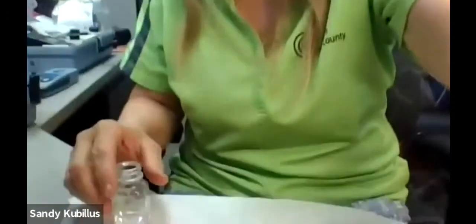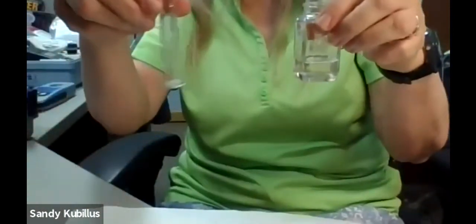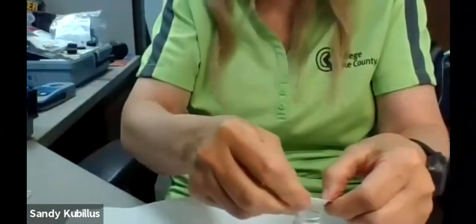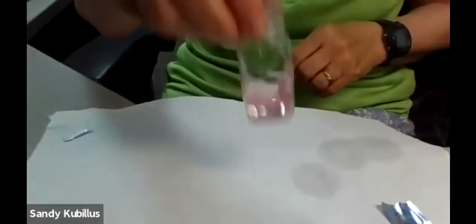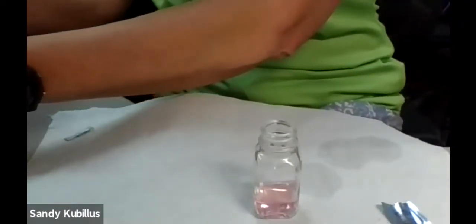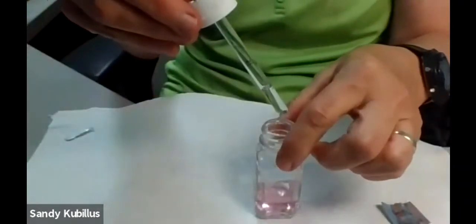Okay, so this is for hardness, and we have our sample, which we collected using this 5 ml tube, and then we'll add this chemical to it, and you can see it changes it to a pink color. Then we're going to add this EDTA for hardness and count the drops.